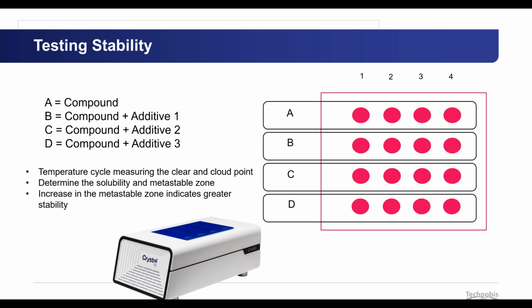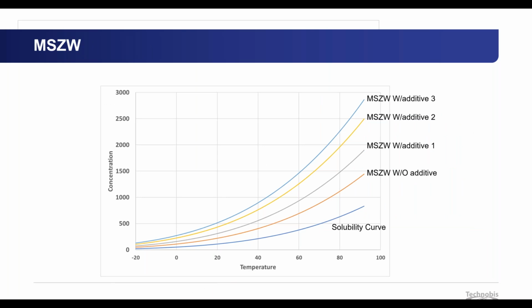I have done many other screens where you actually have more than just 1, 2, 3 additives, or in the same dispersion you use a multiple of additives to be able to stabilize your amorphous in a dispersion. Usually they are temperature cycles. You heat and cool, or you fast cool and evaporate afterwards to be able to make this amorphous solid dispersion.